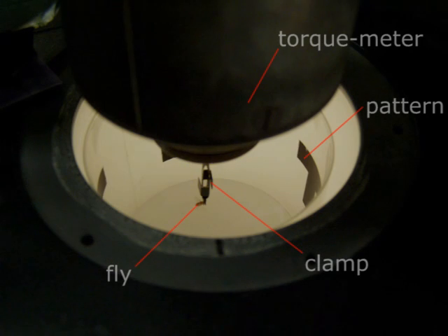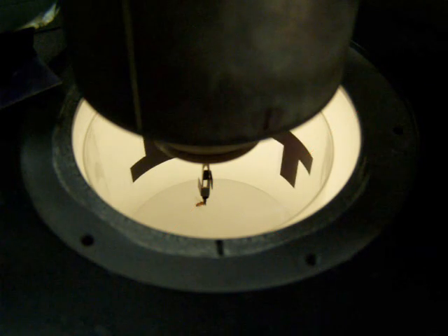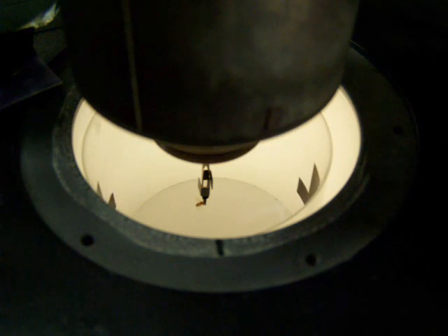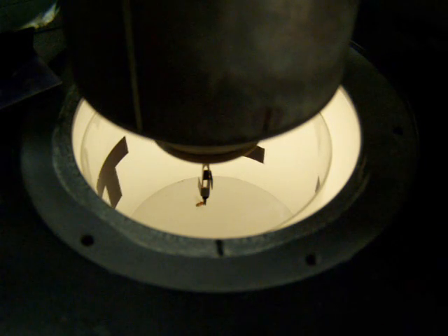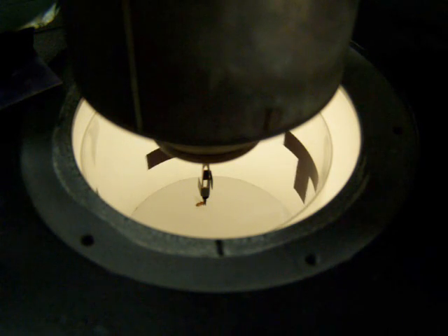But there are still more ways to train flies in this amazing machine. Probably most well known is visual pattern learning. In this situation, the fly's turning attempts are translated into arena rotations via an electric motor, giving the fly the visual impression of actually turning. Heat is then made contingent on one of two patterns being in front of the fly. The color filters can be used in this situation as well, with the color changed exactly between the two patterns.